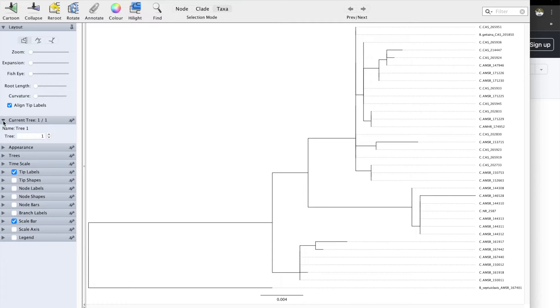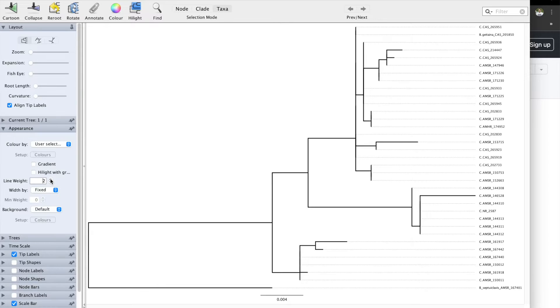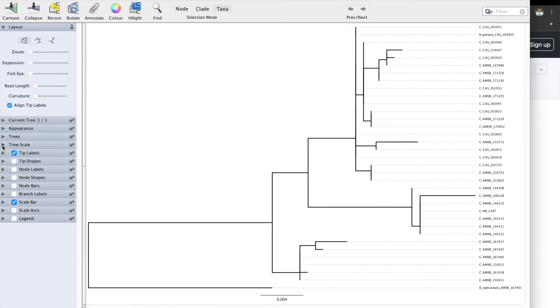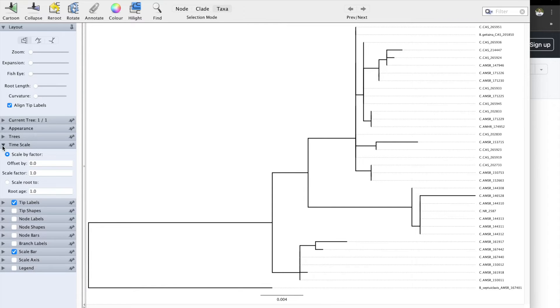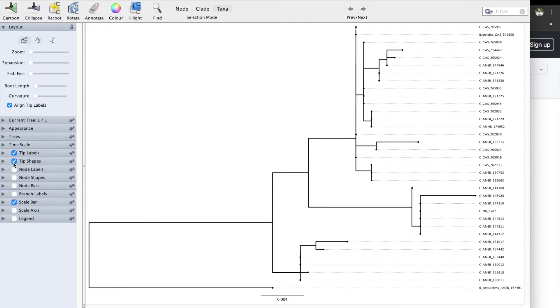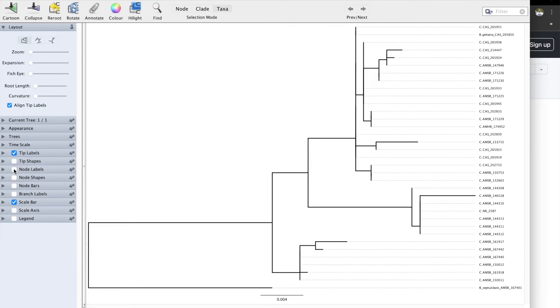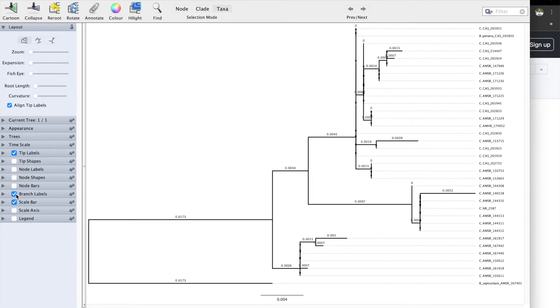We're not going to do anything with the current tree appearance. Let's increase the line weight to two or three — I'm going to keep it at two. We don't have anything for time scale because we don't have any species or fossils to create a reference. Tip shapes we're not really interested in. Tip labels you have to keep checked all the time. Node labels — this is where we show our bootstrap values, either with node labels or with branch labels.